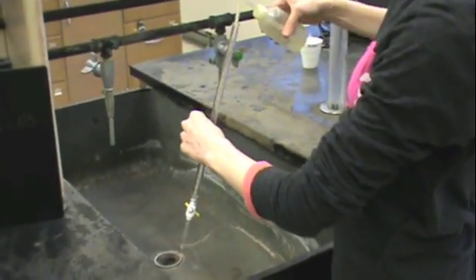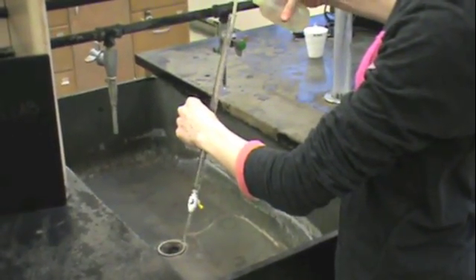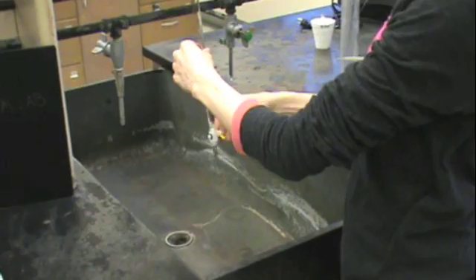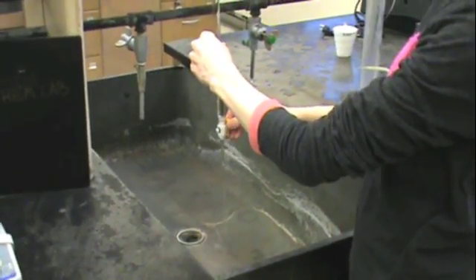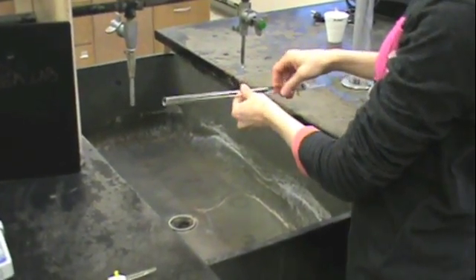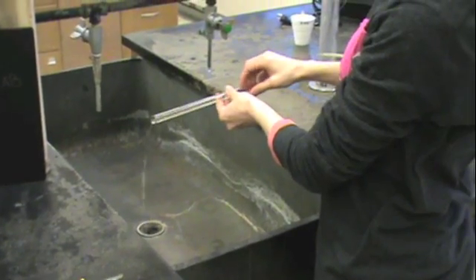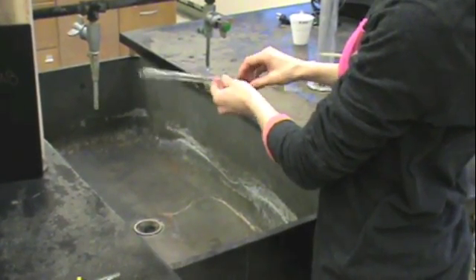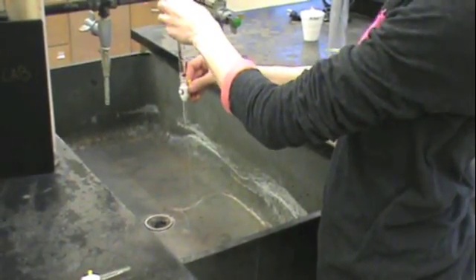Obtain a burette and fill it with deionized water from your wash bottle. You'll want to drain a little bit from the tip and then twirl your burette to get water on all the sides of the burette, and then drain the remaining water from the tip.